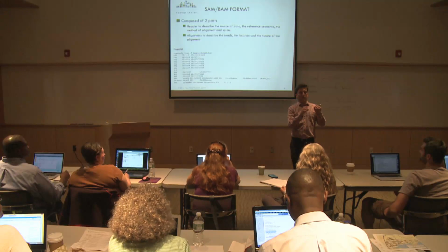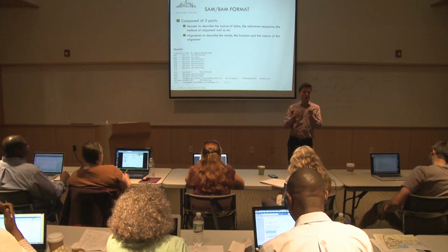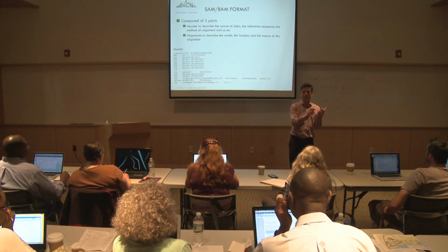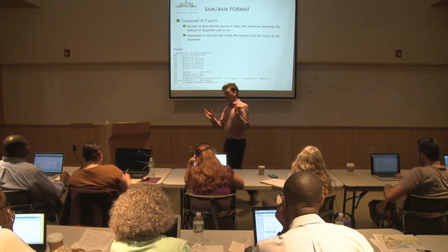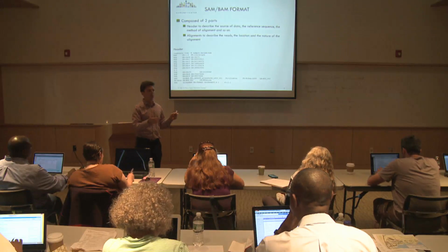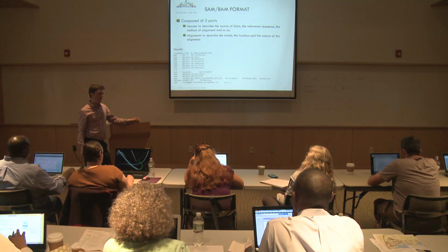So it's a different issue than the duplication that we discussed before. Before it was the exact same reads present multiple times in the FASTQ file. Here we're talking about one single read present multiple times in the alignment. They are similar in the way that they will affect the estimation of the gene expression, which is the ultimate goal. For each gene in the gene family, they would count 10 times.